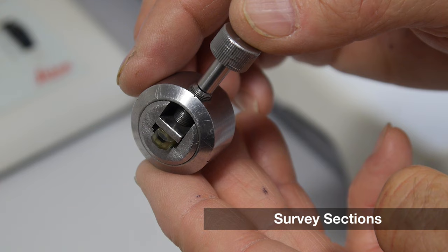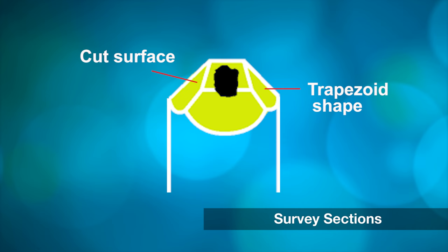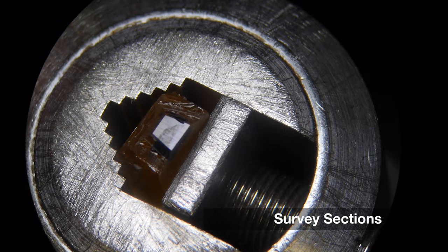First, the area of interest in the tissue sample is identified in survey sections. The cutting of the hardened block is trimmed into the shape of a trapezoid, using a razor blade and a dissecting microscope.